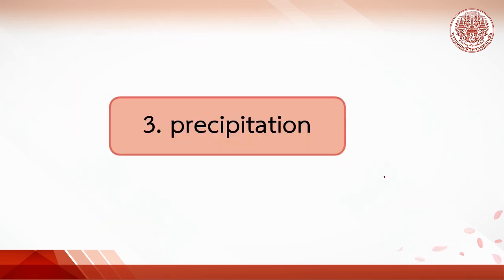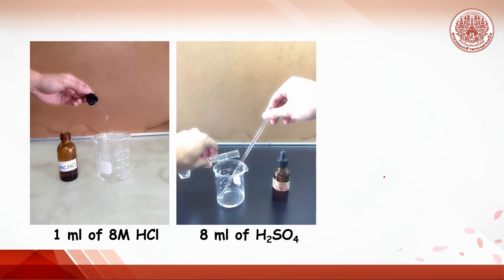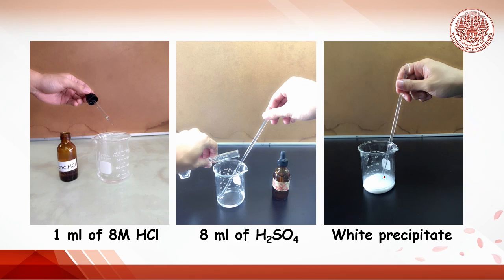We are on the significant step, called precipitation step. First, 1 mL or 20 drops of 8-molar hydrochloric acid is added, followed by 8 mL of sulfuric acid. The white precipitate occurs right away when sulfuric acid is added.